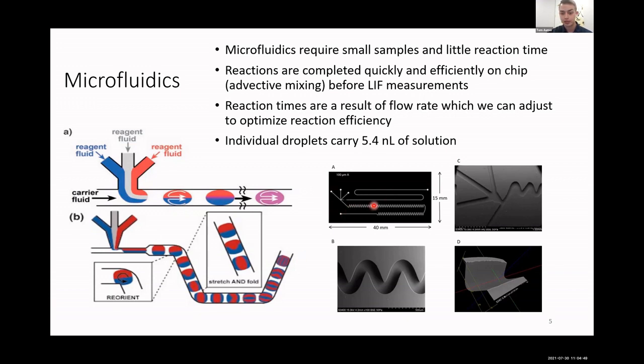As you see here, it'll go through all these channels, and then right at the end, we'll take our measurement. Each droplet will only carry about 5.4 nanoliters of solution.